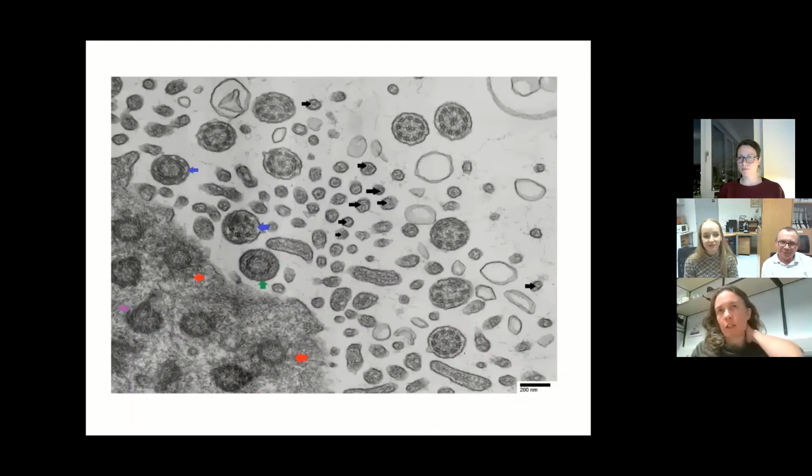And hopefully I'll show you later on that some of the defects only occur in some sections of the cross sections. So if you look at lots and lots of cross sections from just within the region of the microvilli or from just near the top, near the tip, then you miss things and you report normal ultrastructure when it isn't. So this is a healthy sample, and I just thought it was helpful to again look at all these features that I've just described within the context of a sample.